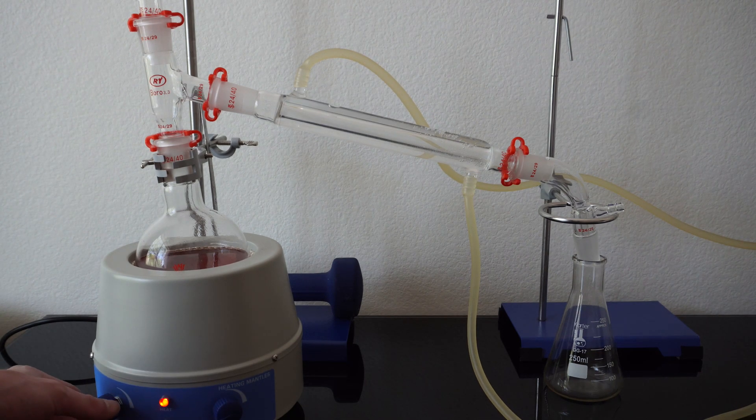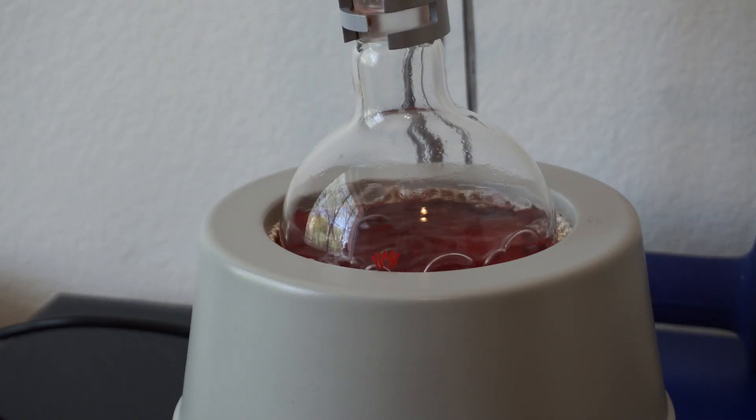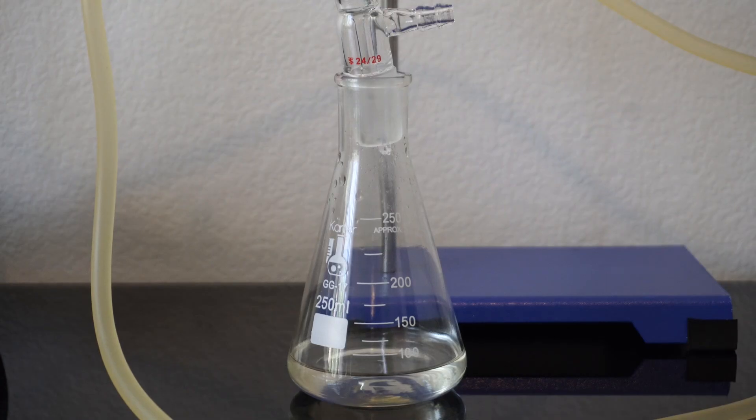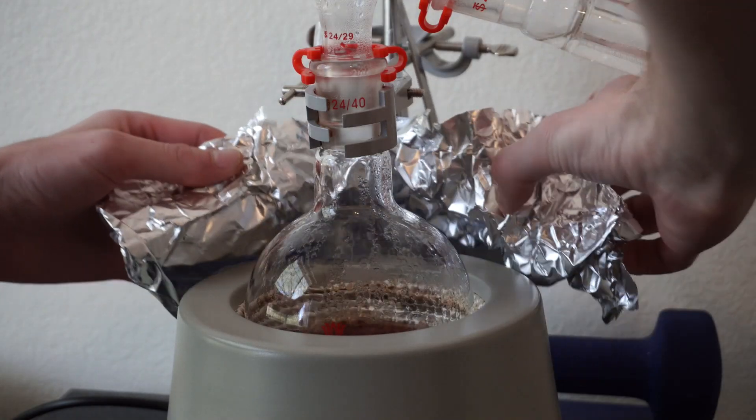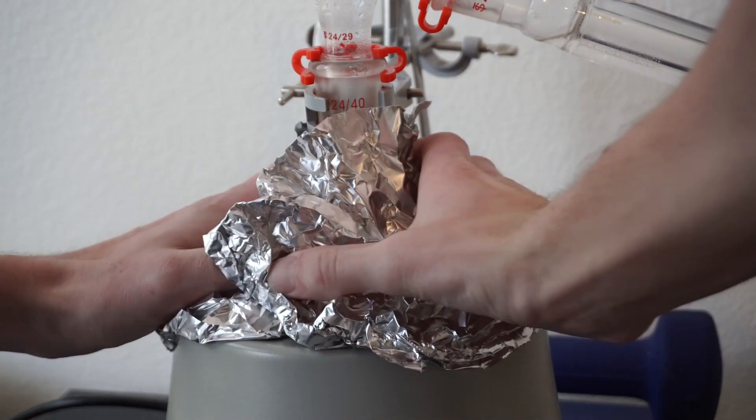After a while, we see the rose water be separated and it is crystal clear. I then wrap the boiling flask in tinfoil and turn down the heat so I do not damage the rose oils and possibly lose smells.